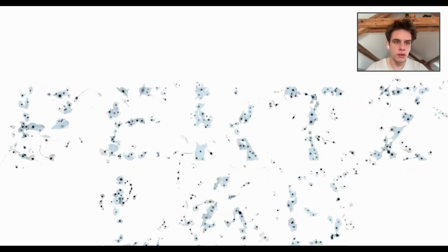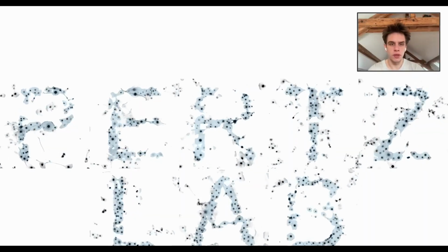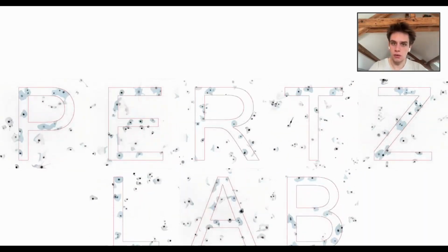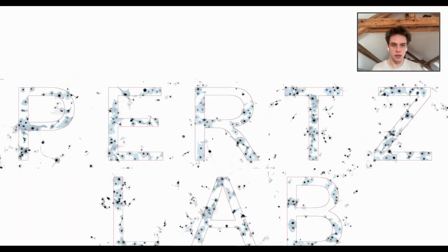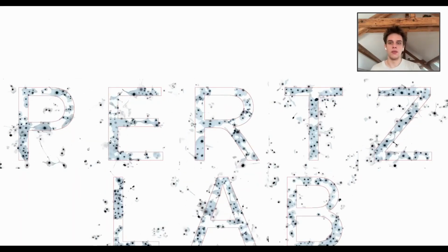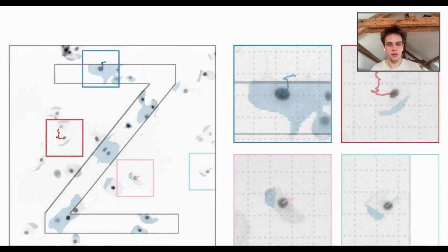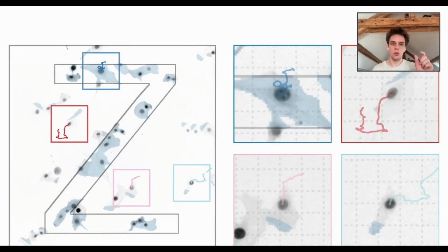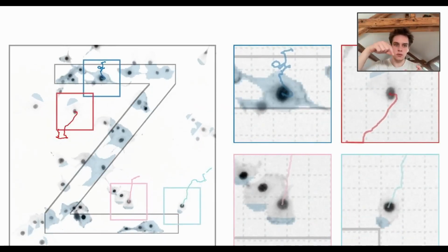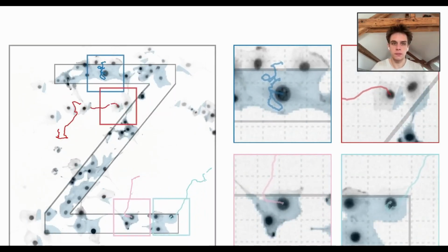Now, this system really gives us unprecedented control over cellular behavior. Here you can see an experiment where we control hundreds of cells in 24 fields of view. I show only the best ones here. Across several days, we can really control where the cells migrate to reach this kind of target shape in the end. And each cell is really controlled individually. So you can see it in more detail here with some cells cropped in, and you can see how we can really steer them around, and the algorithm tries to find open spaces on the target shape and steer the cells towards this place so that the shape in the end is optimally filled out.